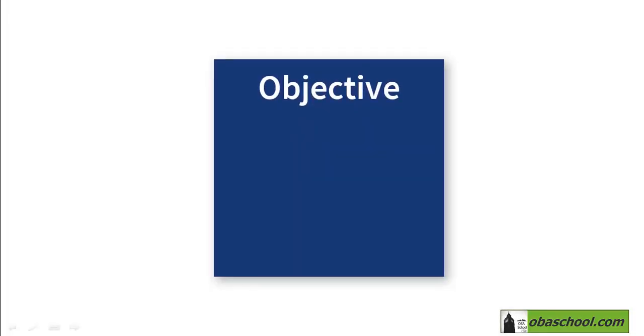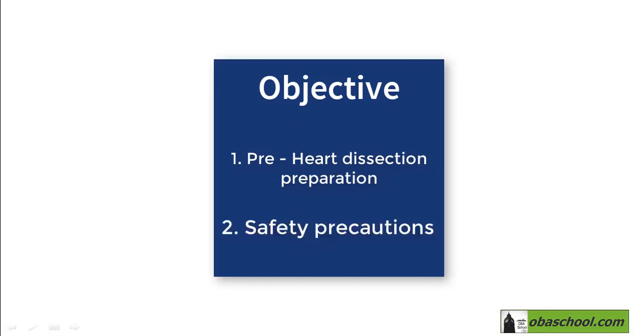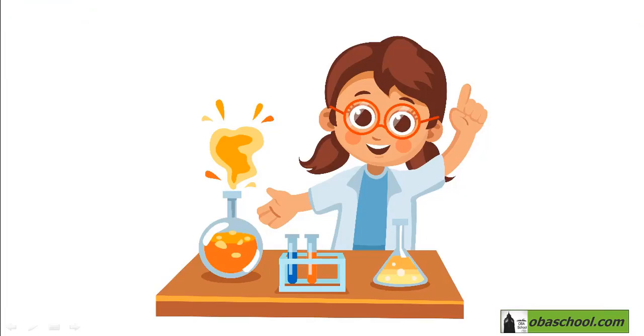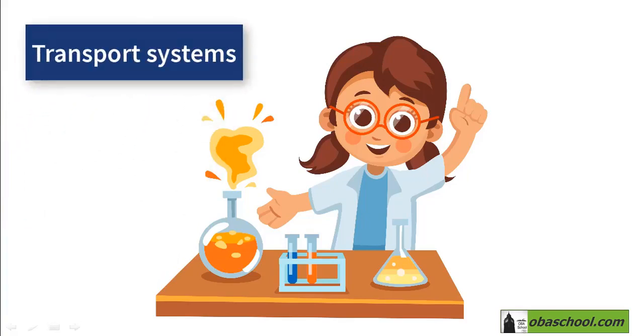In this tutorial, we're going to discuss how to prepare for heart dissection and focus on some safety precautions that you should pay attention to during this procedure. Before diving into any practical work, let's remember some basic points concerning transport systems.